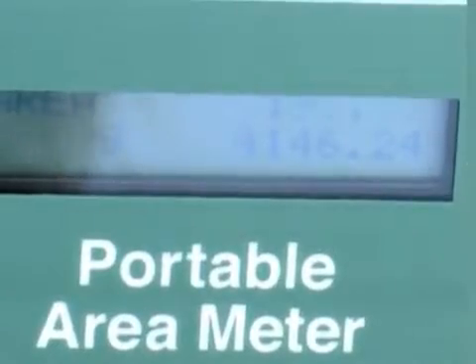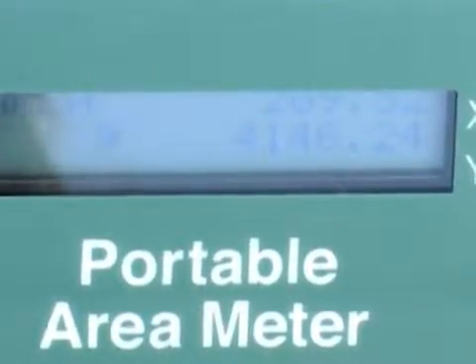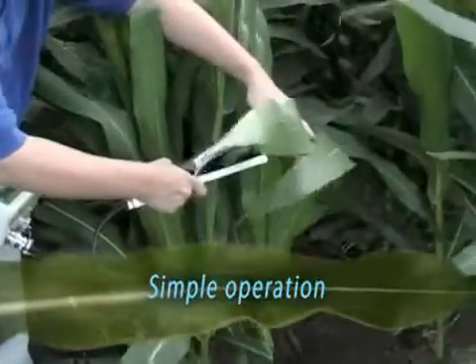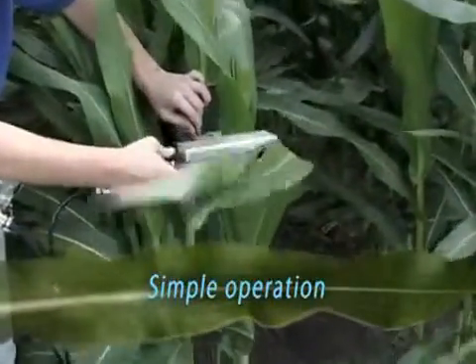Here we see the individual leaf area and total leaf area of the plant being displayed. This real-time data can be saved in the console and later downloaded via our exclusive LI-3000C Windows software into your computer.